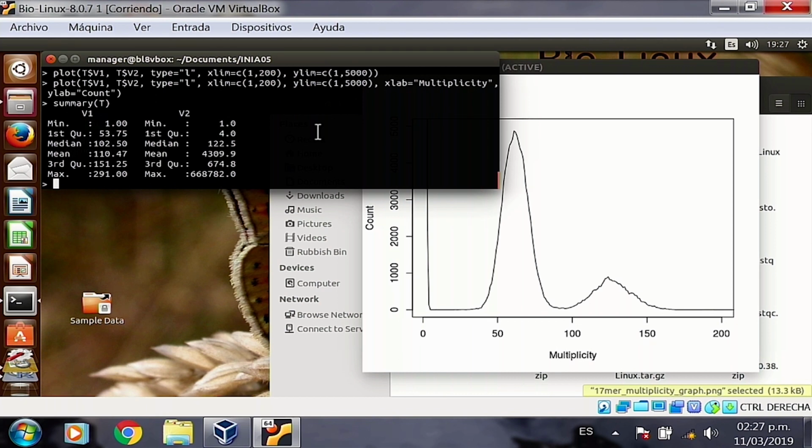So basically, some Kmers have been seen twice as often as the ones that we considered true genome Kmers. Why would I have some Kmers that have around 120 multiplicity, that is, that have been seen around 120 times?